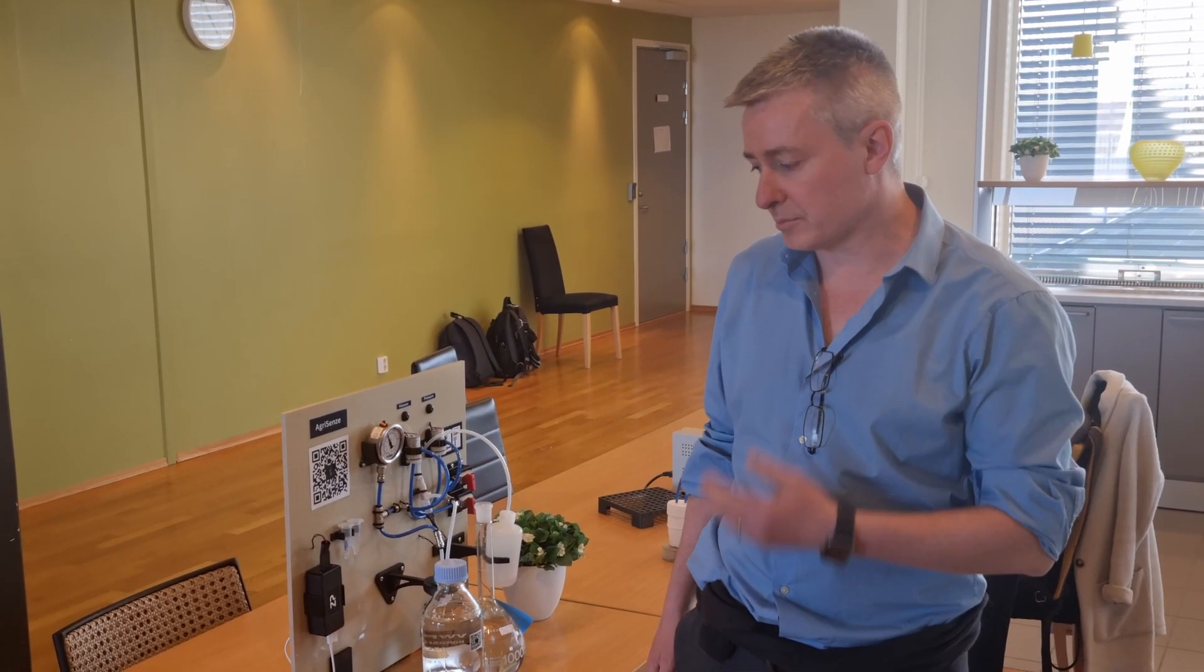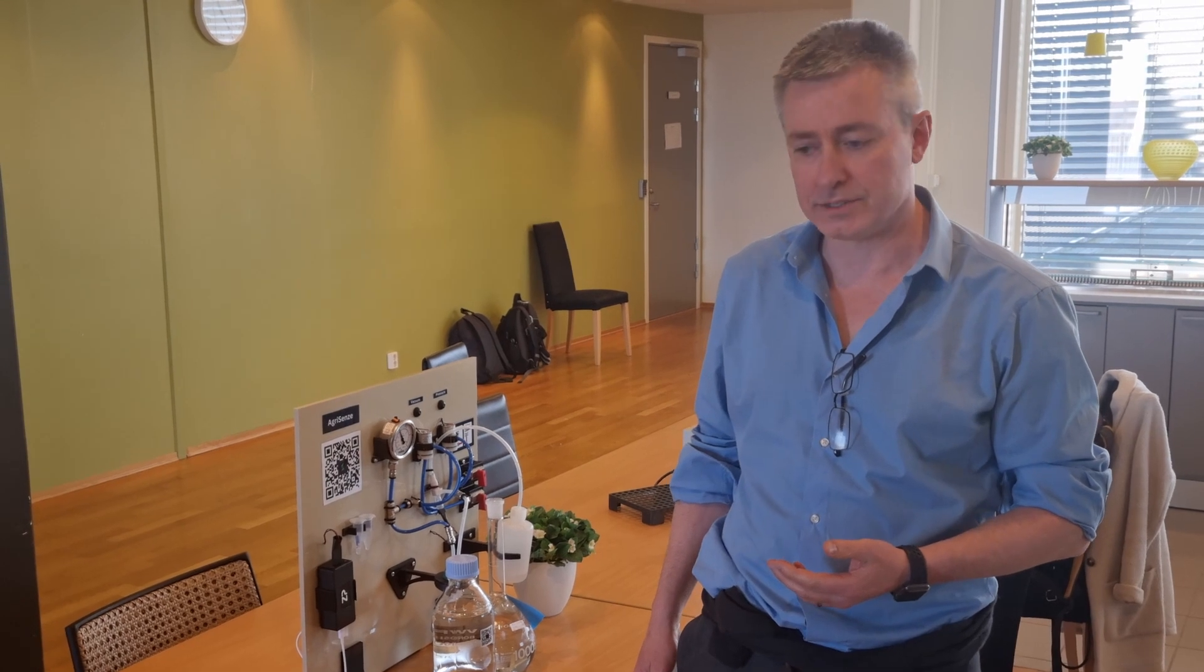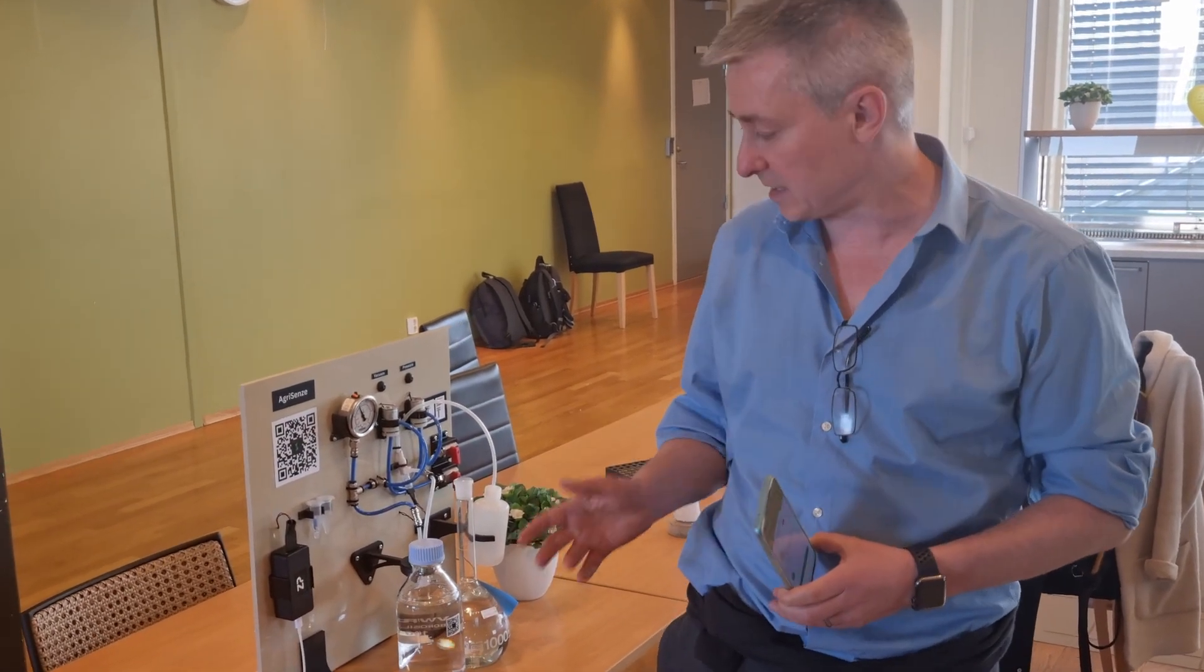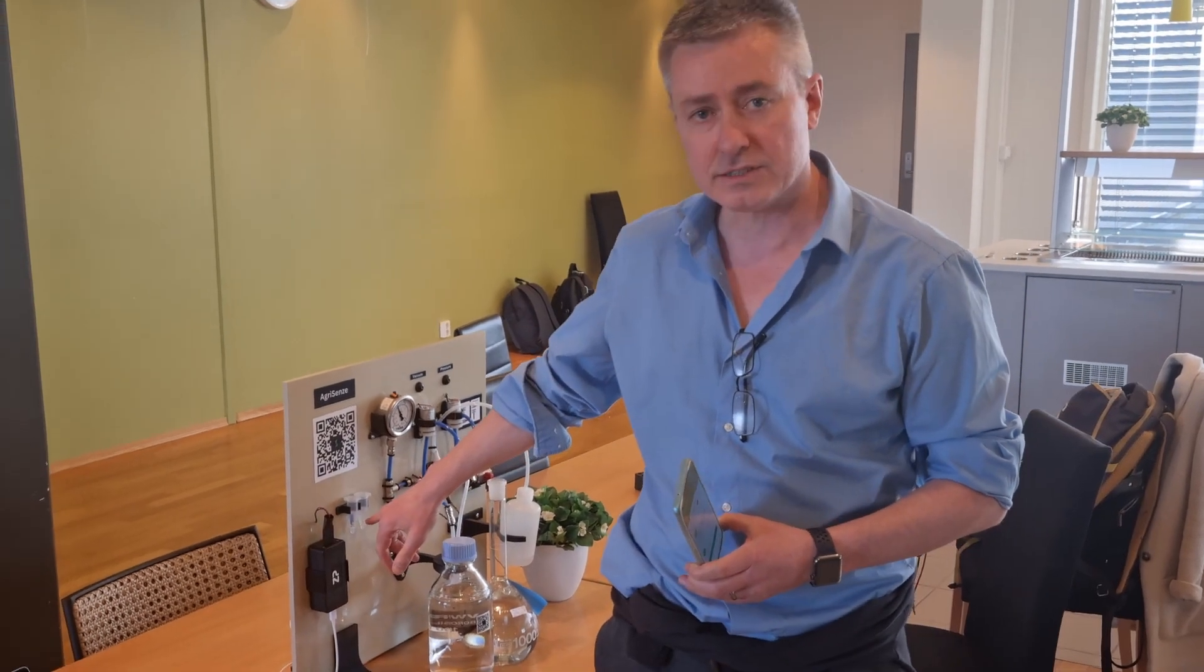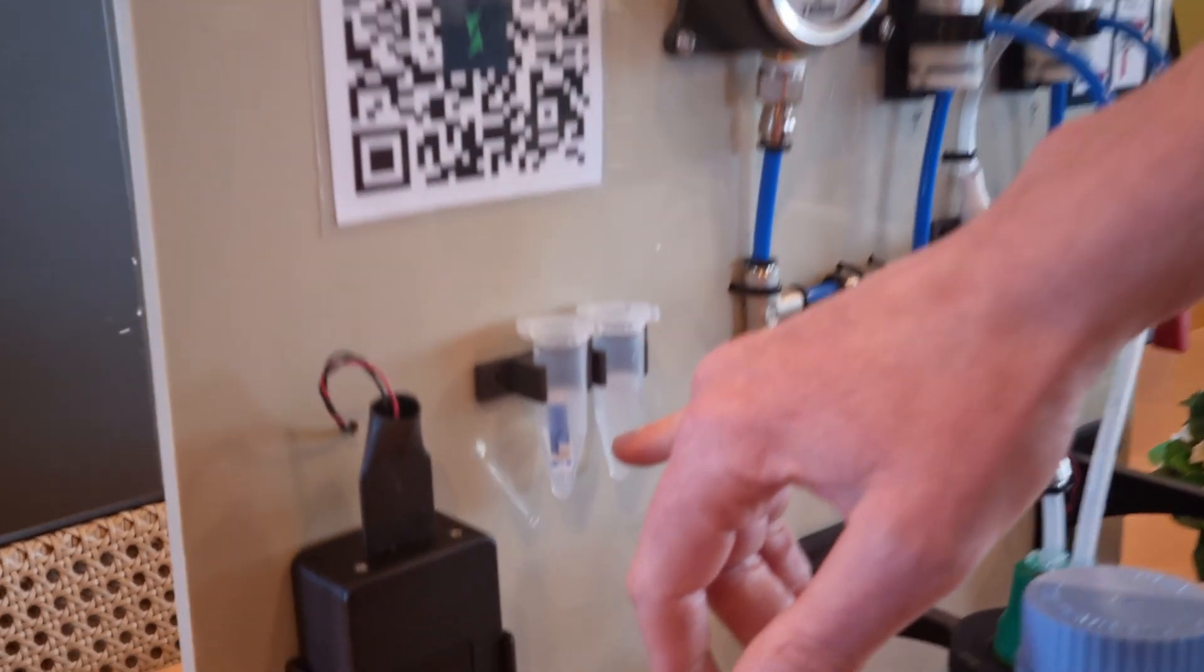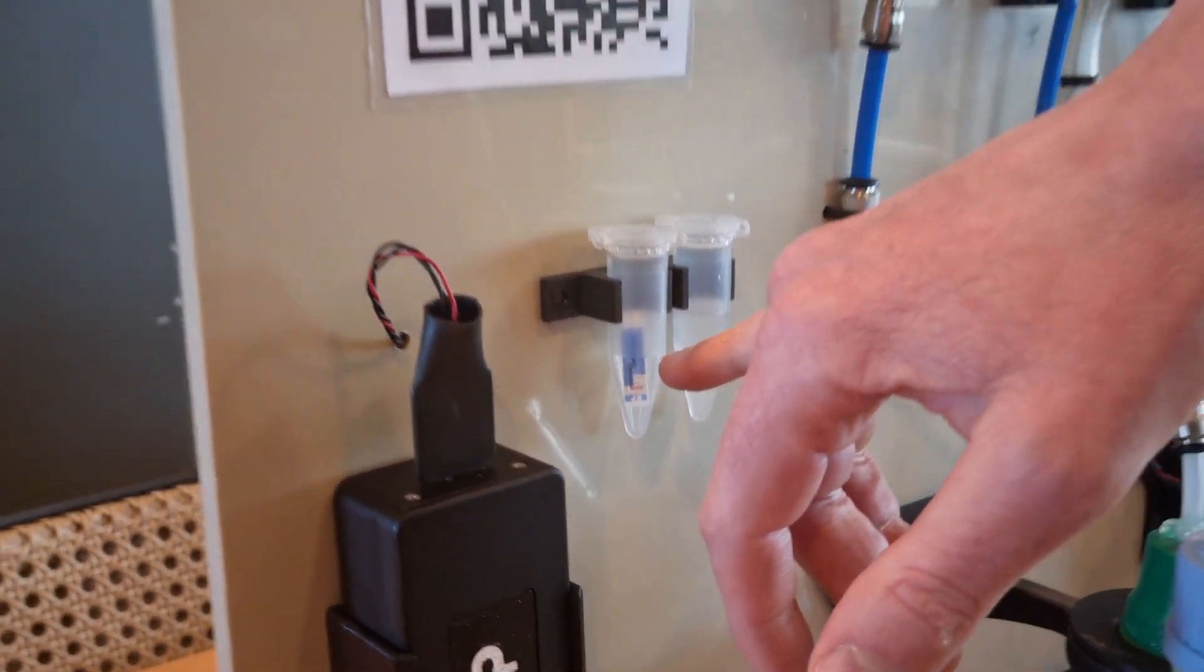Hi, welcome to ZP. What we're showing here is even though ZP is synonymous with sensors, and we do have a little sensor app here. I know you're just coming in on the shot, so there's a sensor here. When I say the word sensor, I'm referring to something like this.